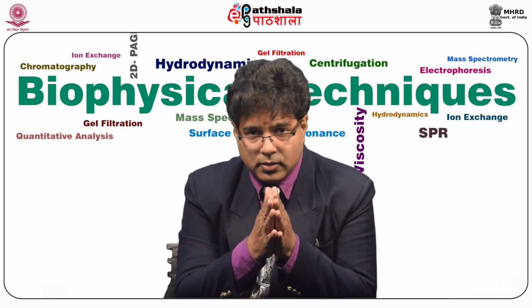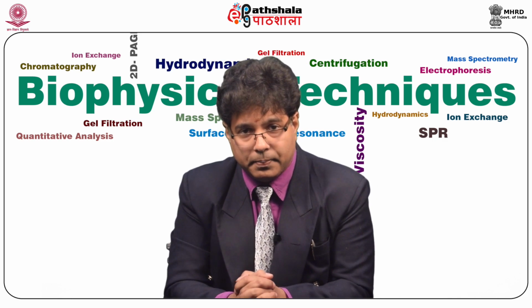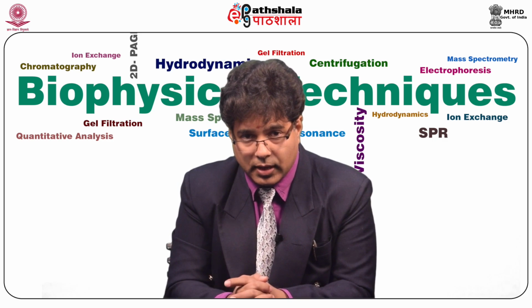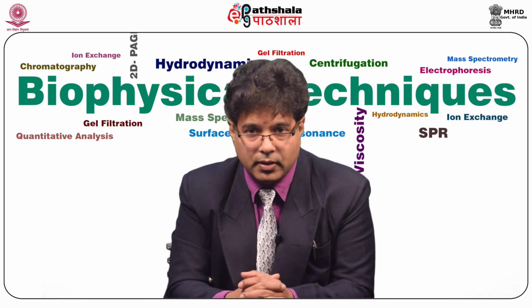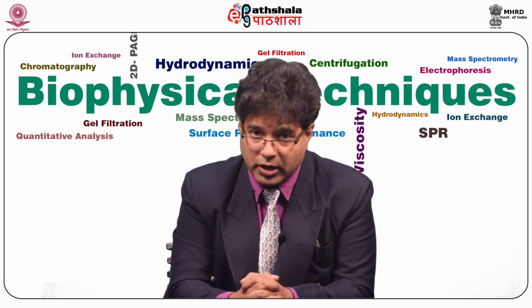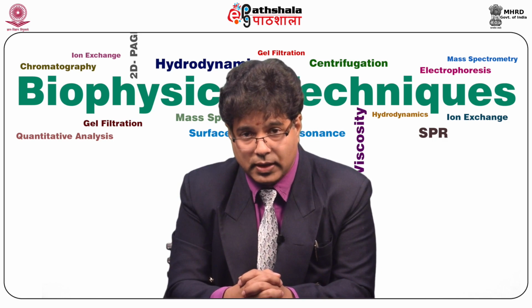Mass spectroscopy is an analytical technique which measures ions by their mass to charge ratio, that is m by z. As a prerequisite, all compounds must be ionized and made into a gaseous state, so that they can travel in vacuum. As you know well, only charged or ionized compounds can travel through vacuum and they are susceptible to magnetic as well as electrical deflections.